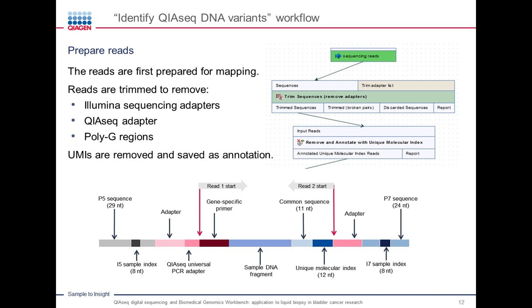The trimming step in the QIAseq panel plugin workflow is able to perform automatic trimming, which is capable to recognize and remove also, for example, the read-through signal, which might happen when the fragment being sequenced is shorter than the read length, and therefore the sequence might include a read through the reverse complement of the adapter from the start of the other read.